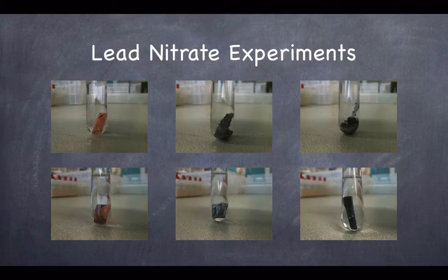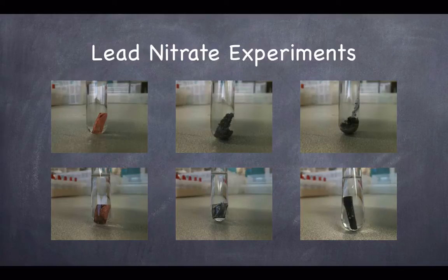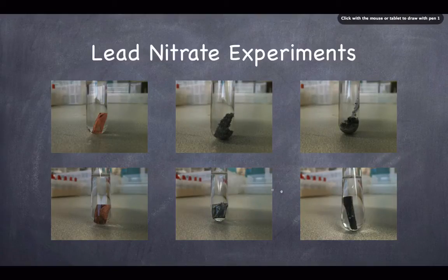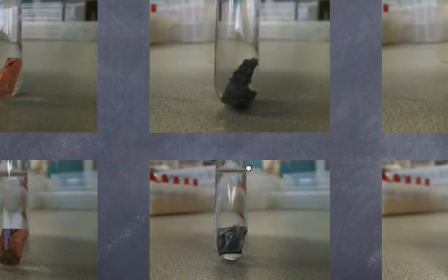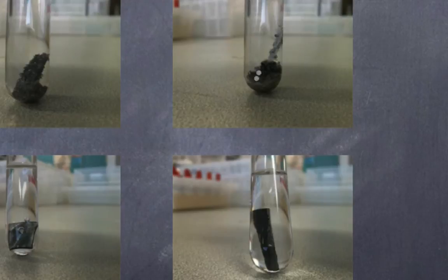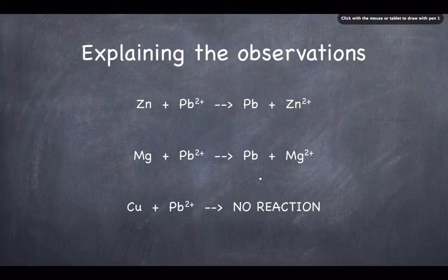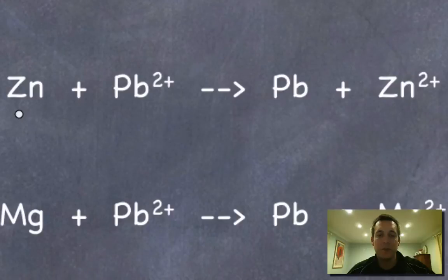Now let's look at some more interesting experiments — the lead nitrate experiments. Each tube has lead nitrate in it, and we've got three metals: copper on the left, zinc in the middle, and magnesium on the right. Copper hasn't changed much, so copper atoms weren't able to give their electrons to the lead ions. Zinc certainly has reacted — there seems to be a new metal formed on the surface — and the same is true for magnesium.